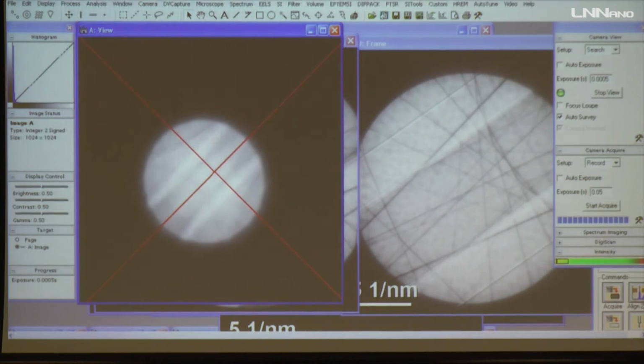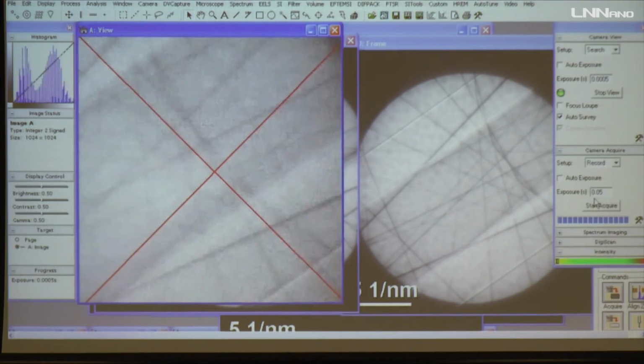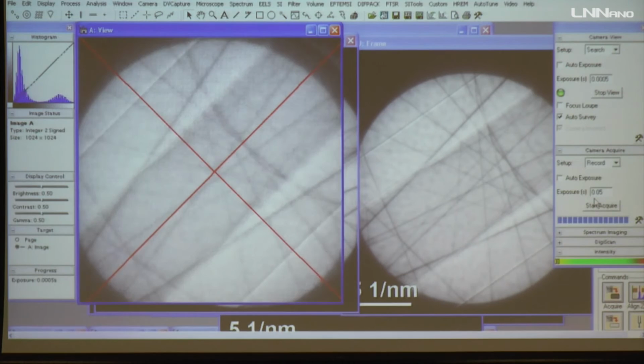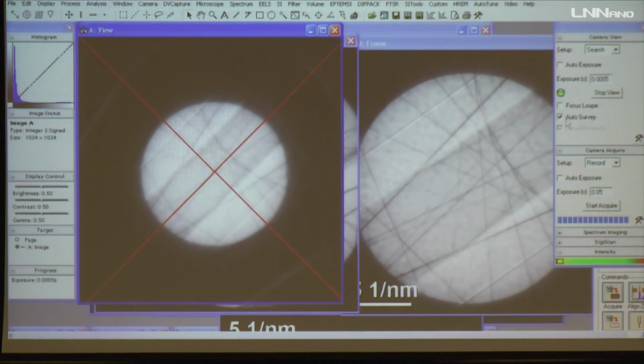So for going to a two-beam case, it's simple, but this orientation, okay. I tilt the sample in such a way that it has only two beams.